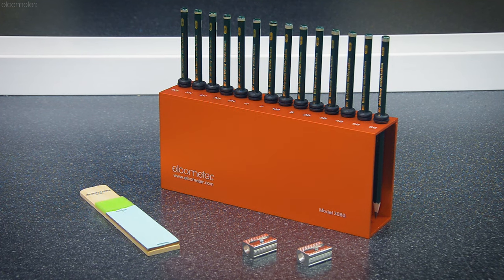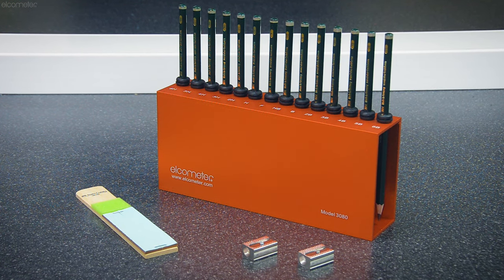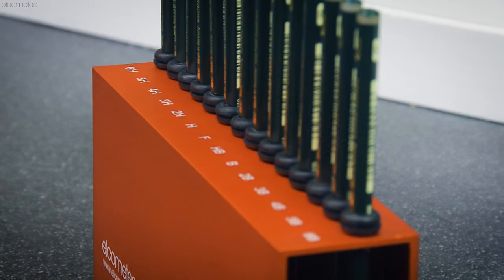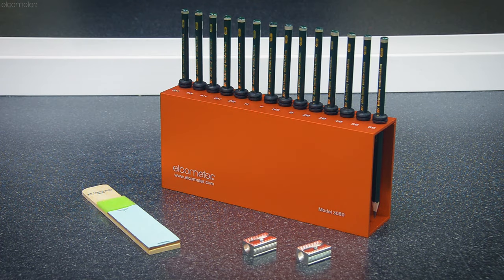The Pencil Hardness Test can be completed freehand using the Elcometer 3080, which includes a set of 14 pencils grade 6H to 6B, two specialised pencil sharpeners, and an abrasive paper block to prepare the pencil for testing.